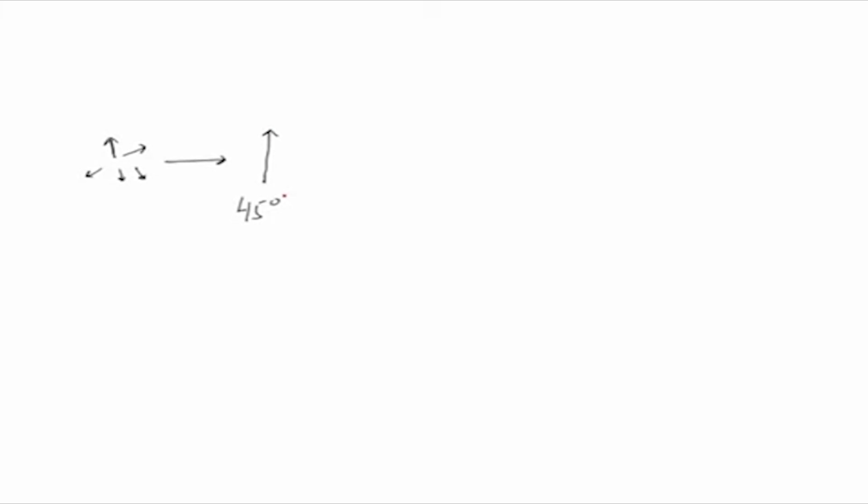Now, as per the axis of the polarizer, you will get a particular plane polarized light. Now, this plane polarized light has to pass through the specimen through the condenser actually. So, if I say my sample is oriented in this direction, all right, now your sample is oriented at a particular angle.